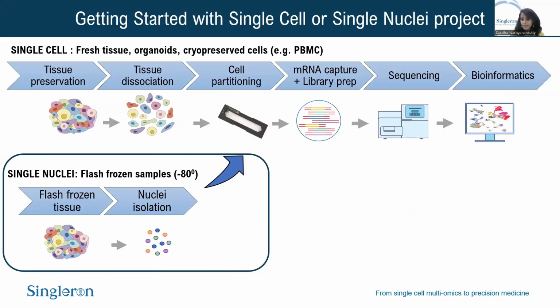Just to come back here, I also want to quickly mention the single nuclei workflow. As mentioned, if your samples are flash frozen, you can do the same thing. Once you isolate your nuclei, you can use these kits to do the remaining part of the workflow.